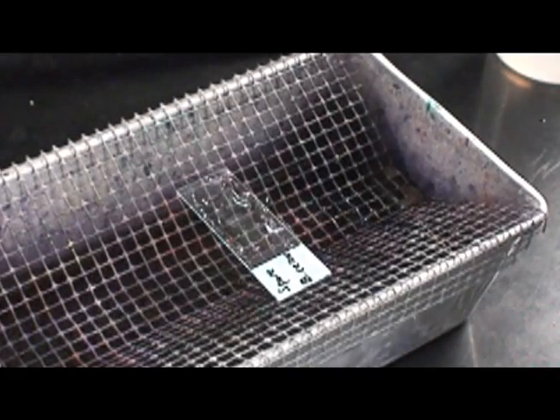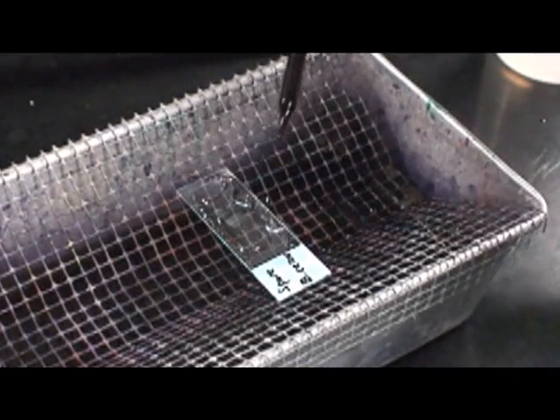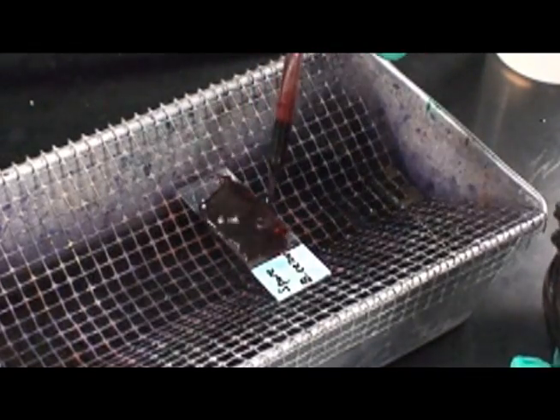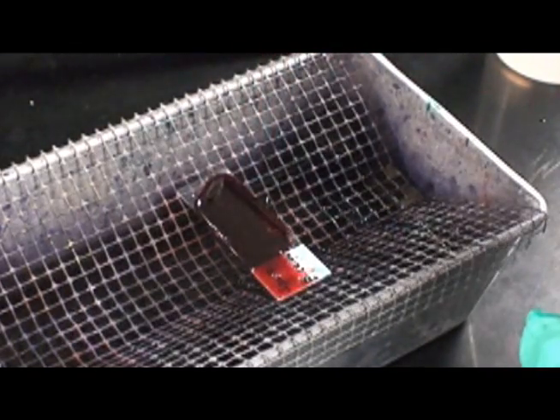Counter stain the slide by flooding with safranine for 30 seconds. After 30 seconds, be sure to wash the slide again with water.